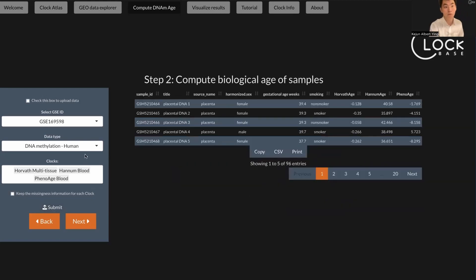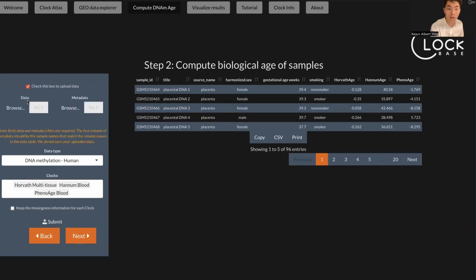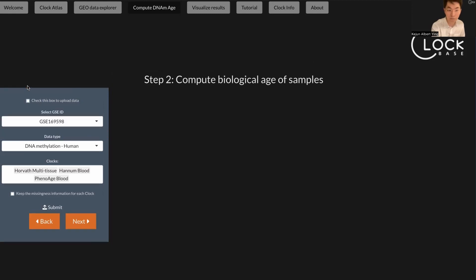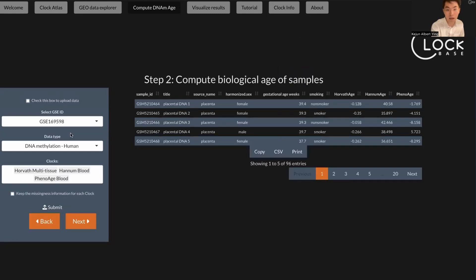Let's untick this. Also note that if you don't want to analyze the GEO data and you want to upload your own data, you can also do that by clicking this box. It will pop up a new UI and it will allow you to upload your own data and your own metadata annotation. Let's go back.